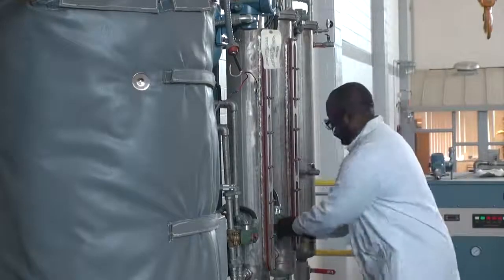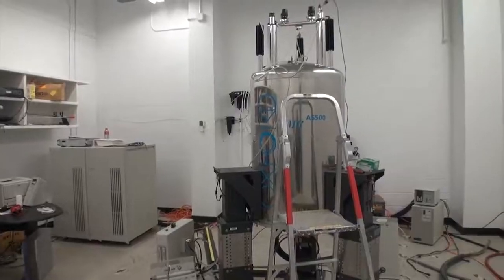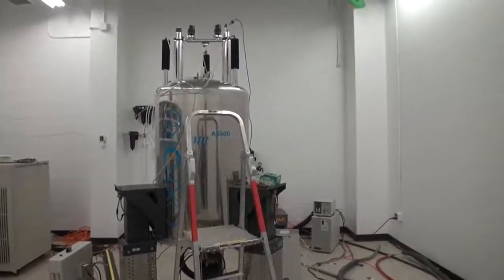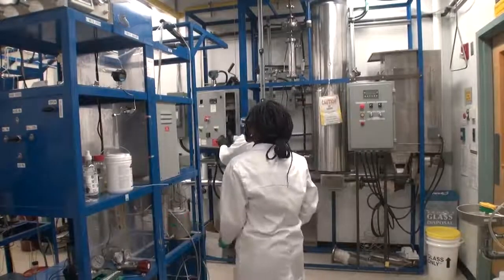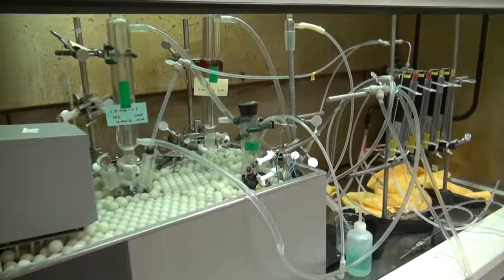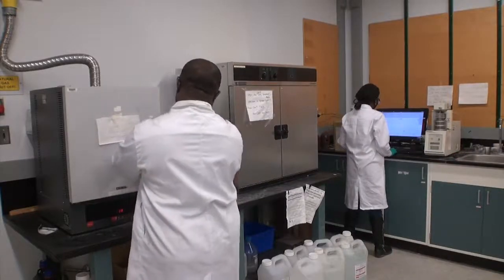From magnetic resonance imaging to scanning electron microscopy, to x-ray diffraction analysis, to gas chromatography and mass spectrometry, CETRI is one of the best equipped research laboratories in the world.